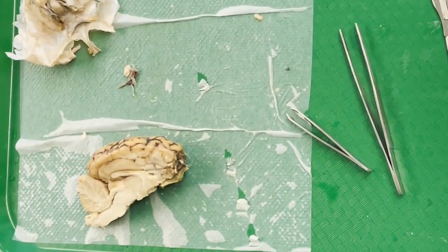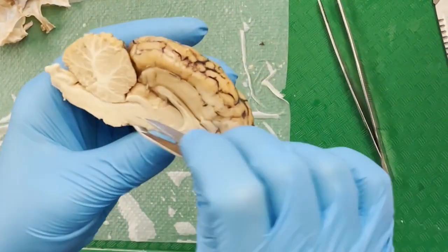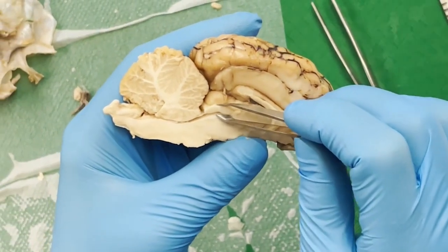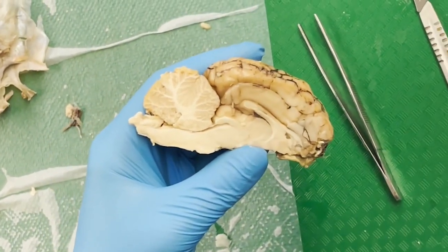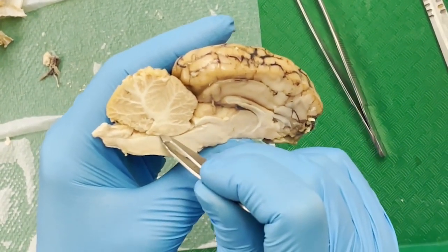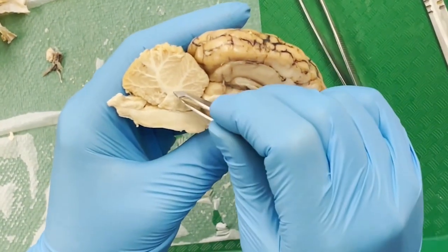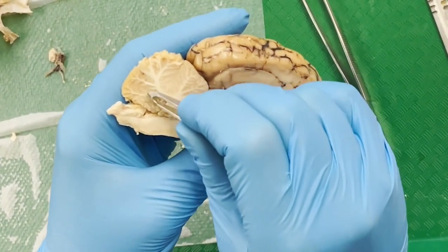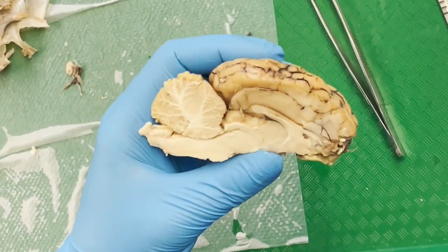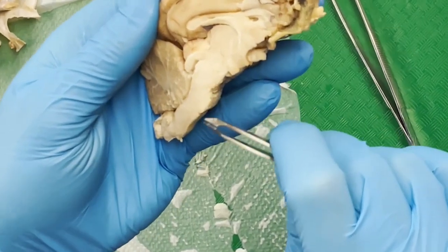What you have that the other ones don't in yours. So then we've got superior colliculus here, inferior colliculus. We have a cerebral aqueduct here, and then fourth ventricle here. And then we have these arbor vitae going throughout all of here. You can see from the cross section, we have the pons here.